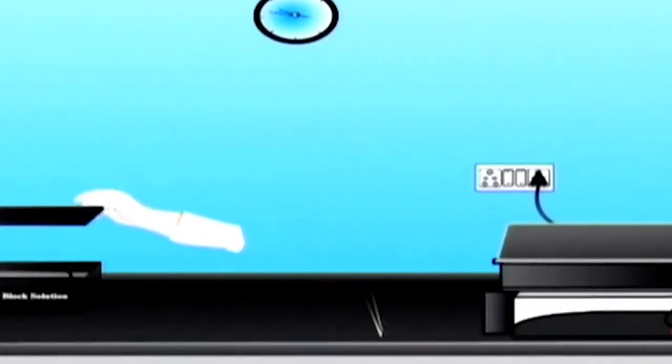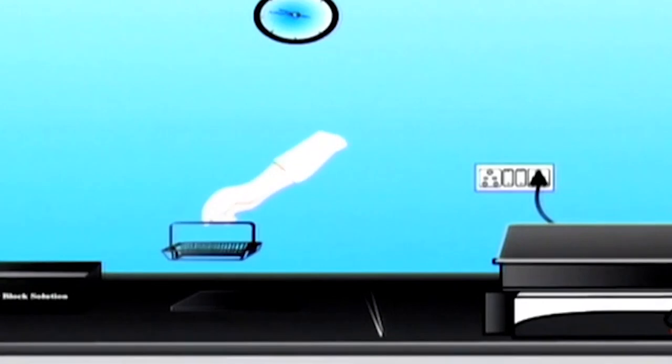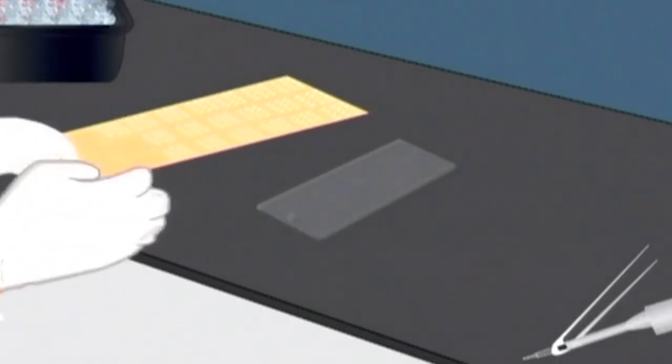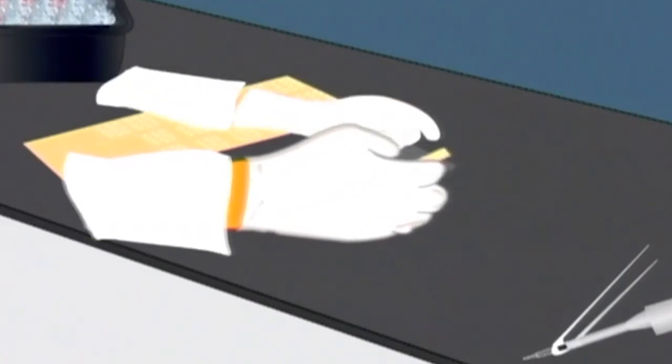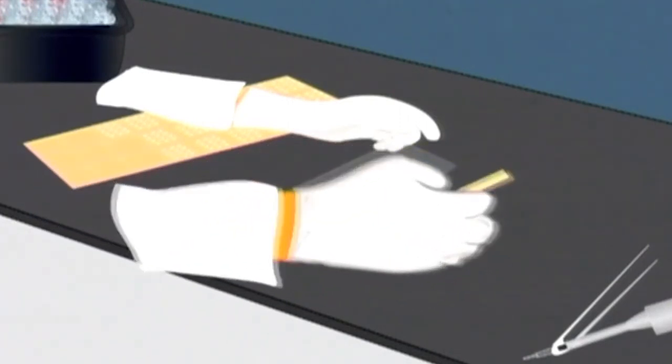To perform the DNA staining, first prepare the PicoGreen stock solution and dilute it in milk or SuperBlock. Block the chips with the SuperBlock for an hour, and after blocking is done, we can use the PicoGreen mix to place on these printed slides. So, let us first look at the NAPPA expression on the slide, and then I will describe scanning for both DNA printing and the protein expression at the same time.